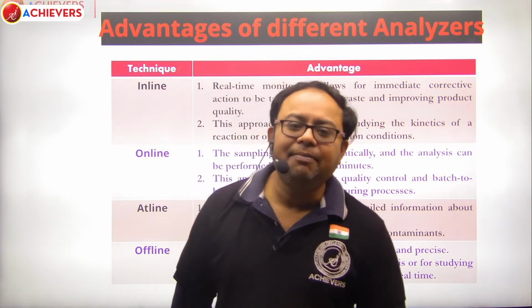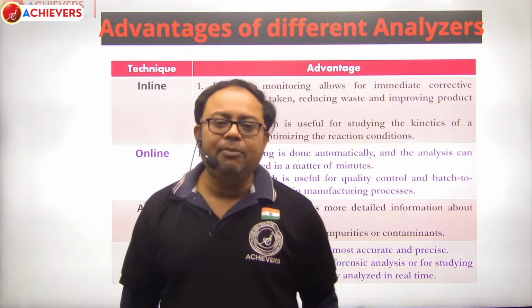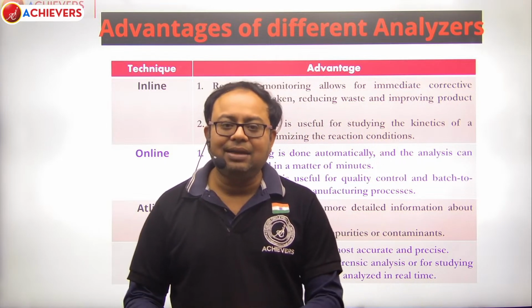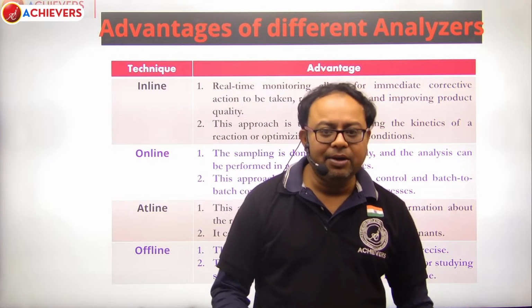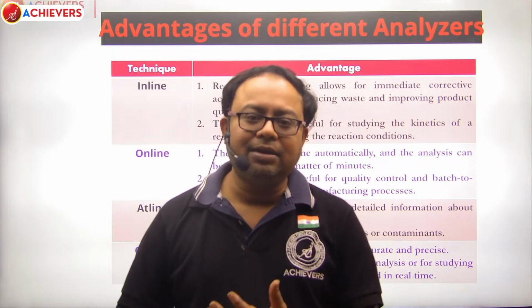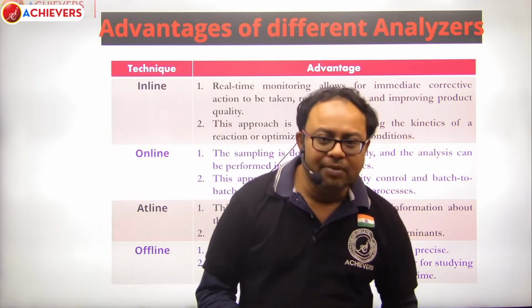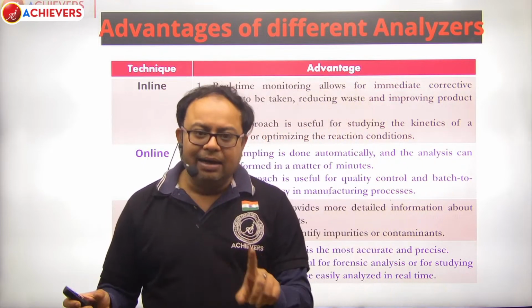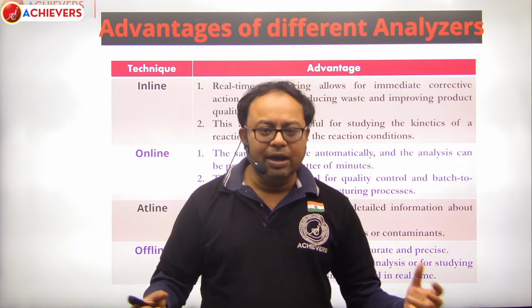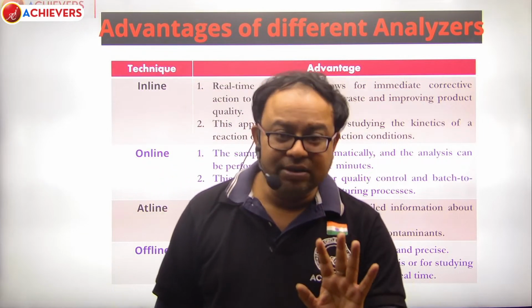As you have real-time monitoring of a chemical reaction, you can analyze its kinetics, because kinetics is nothing but monitoring the concentration of any chemical component participating in the reaction with respect to time. And if you can get a real-time analysis, then obviously you are equipped to study the kinetics of that particular process. So this is the advantage.